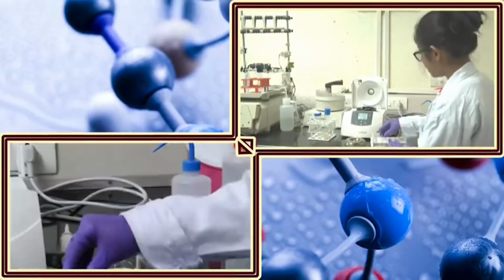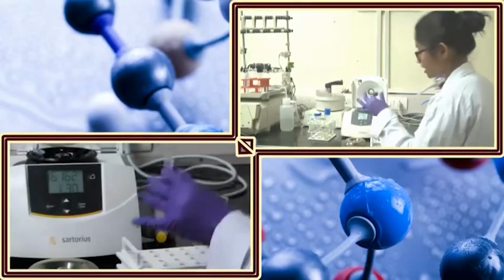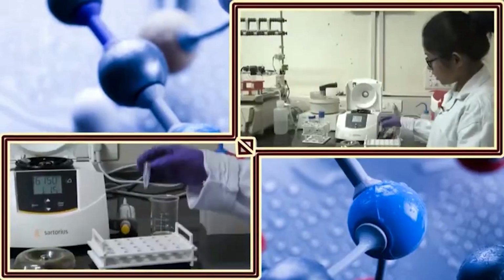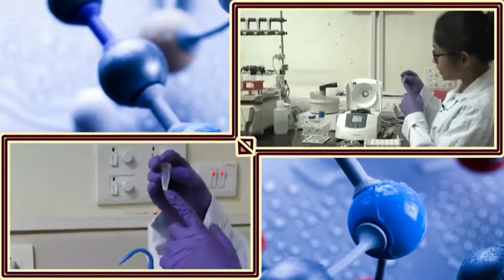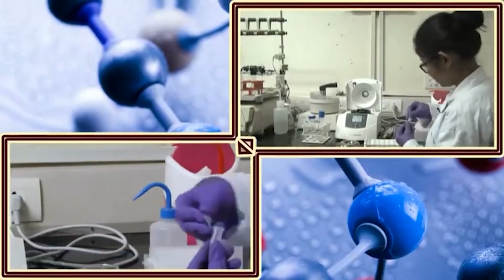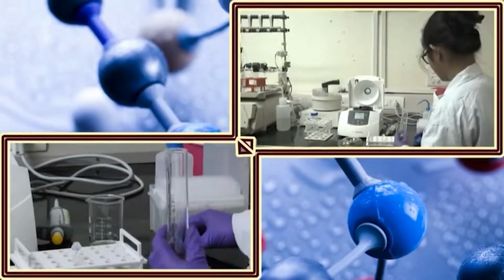So, now I have taken around 1.2 ml. I will again take the same culture in the same tube, as I have discarded the media. So, the tube is now free. Again in the same tube I will take more culture. Now, as I have discarded the supernatant from this culture tube, you can see only the pellet is there and the tube is free now. So, I will be taking another 1 ml of culture in the same tube, so that around 5 ml of culture, all the cells are taken into the same tube.